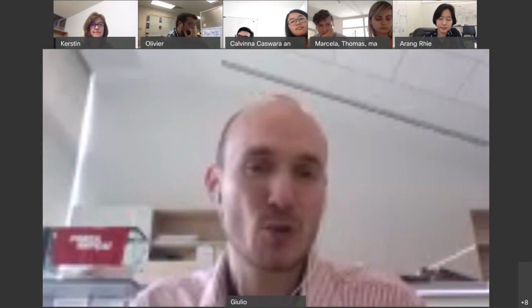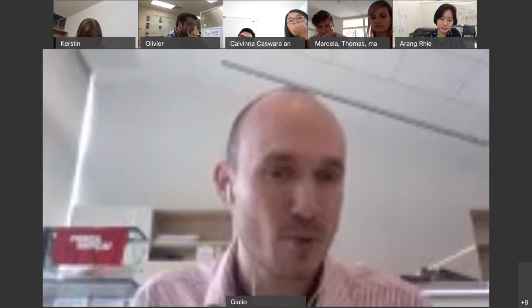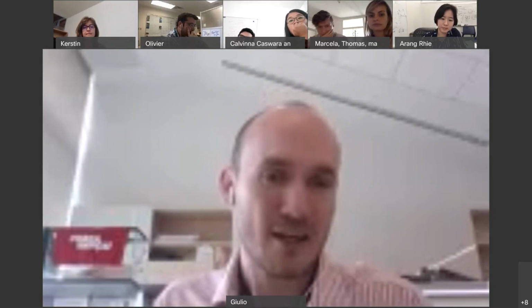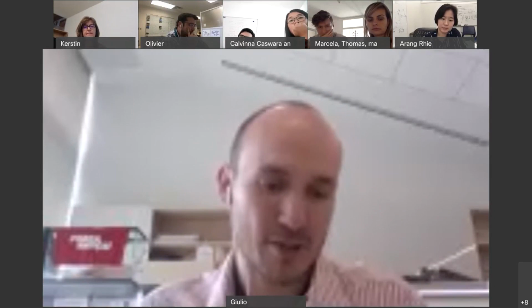But if you instead use a very large reference data set with any possible mito, and there are other mitos present that you are not aware of, but they are still in the GenBank, and if Canu is able to assemble them independently, which should be the case if the contamination is high enough, then you will detect them in the subsequent phases. So that will work.